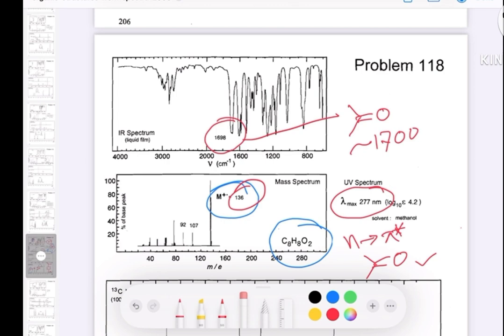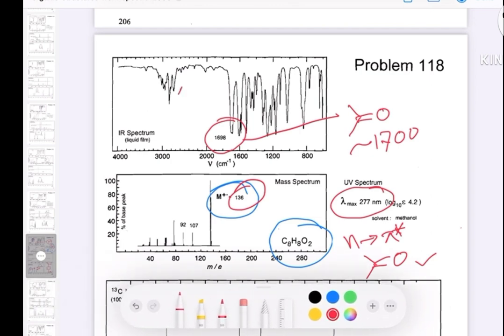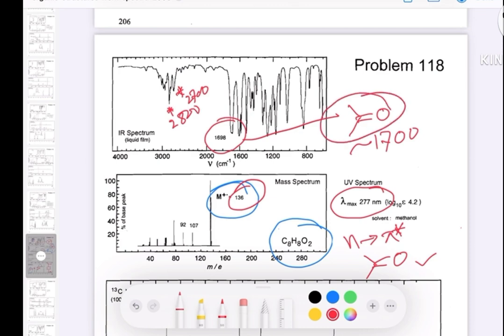I also mentioned previously that if you have a carbonyl group, look for two distinctive peaks around 2800 and 2700 cm⁻¹ for an aldehyde. Here we can see two peaks — one at 2700 and another at 2800 — so along with the carbonyl, this confirms you have an aldehyde group.